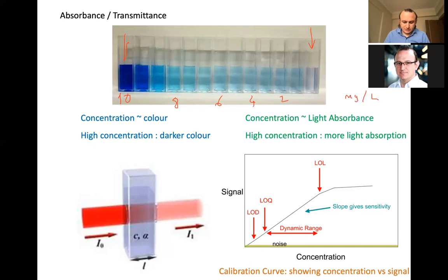And as you can remember, we were using some light source. So there is a bulb, and the light with a high intensity, which means quite big number of photons, is sent to the sample. And in the sample holder, depending on the concentration and of course the wavelength of the radiation, the light can be absorbed or it can be transmitted.